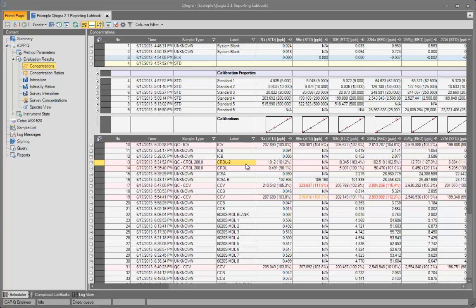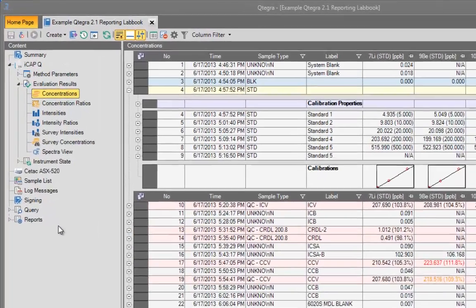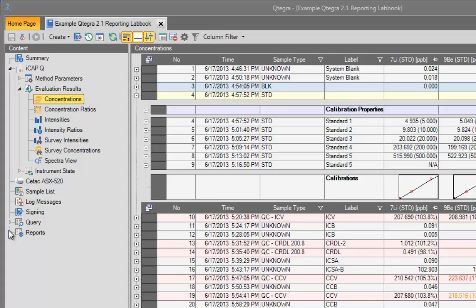Reports are displayed inside the open labbook. The available reports are displayed in the content list on the left-hand side of the labbook underneath the heading Reports.